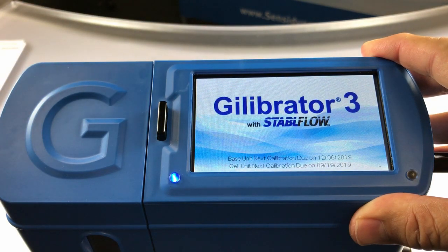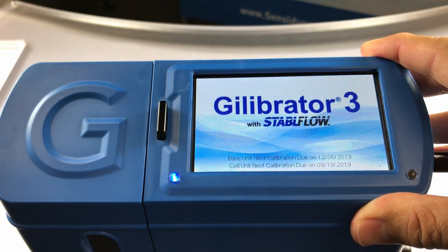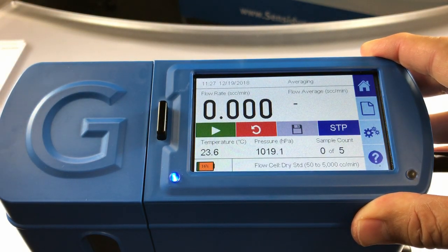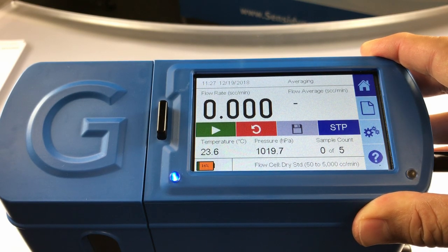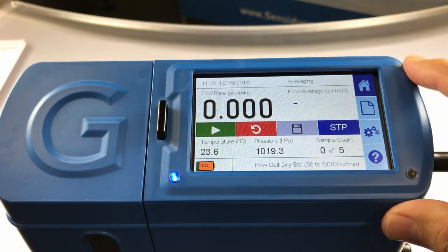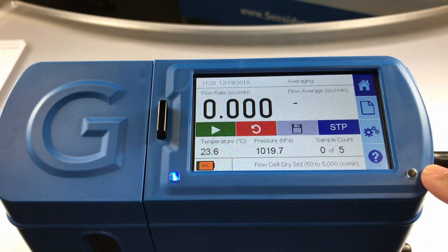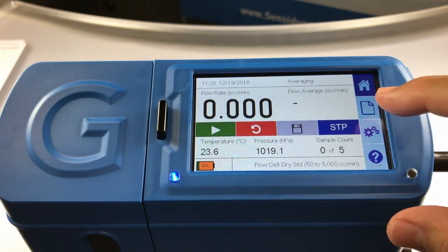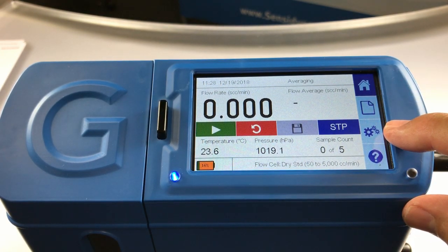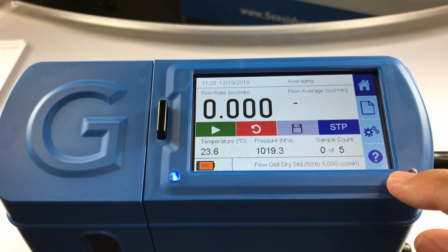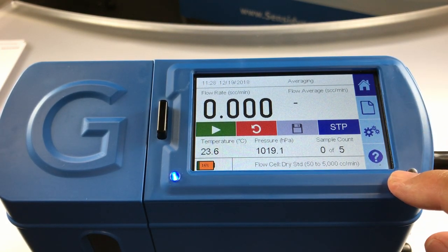The home screen appears upon initial startup. From the home screen, the user can begin to calibrate their pump, or they may use the vertical menu bar on the right side of the screen to open the reports page, the settings page, or the information screen.